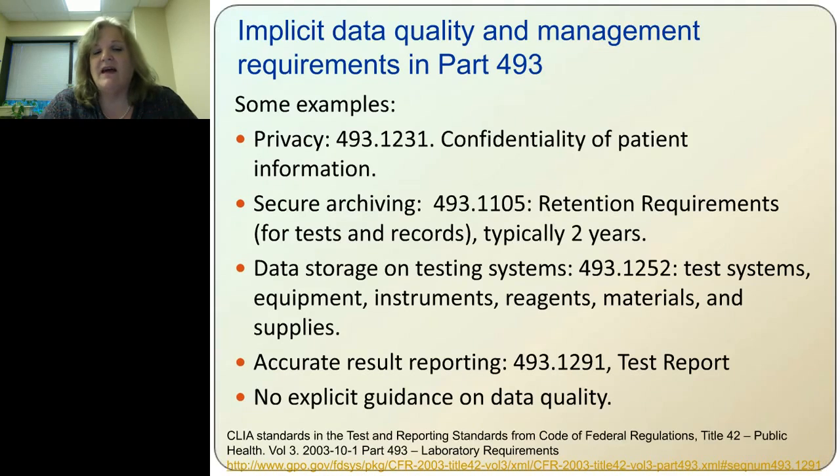And also you have to have accurate result reporting, and your test reports have to have a certain amount of data in them. And that reporting somehow has to come out of your information management system in a correct and accurate manner to give the correct report to the clinician. But there's no explicit guidance on the quality of the data, and there's no actual regulations that try to do quality control on the data that's within that clinical laboratory information management system.